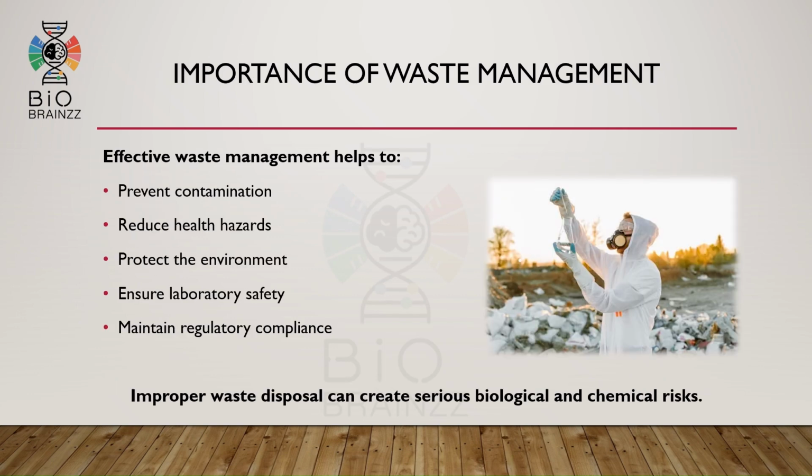Effective waste management is essential for maintaining a safe laboratory environment. It helps prevent contamination, reduces health hazards, protects the environment, and ensures laboratory safety. It also helps laboratories to maintain regulatory compliance. Improper disposal of waste can create serious biological and chemical risk.